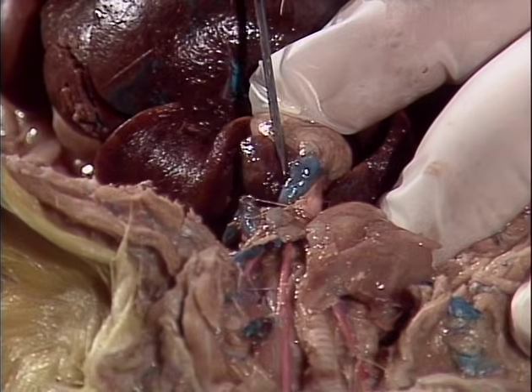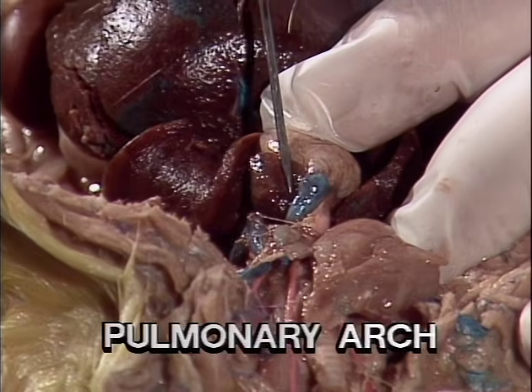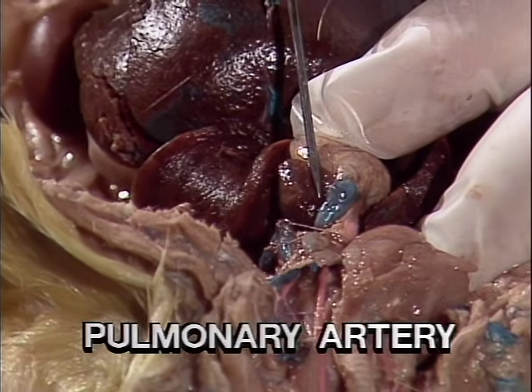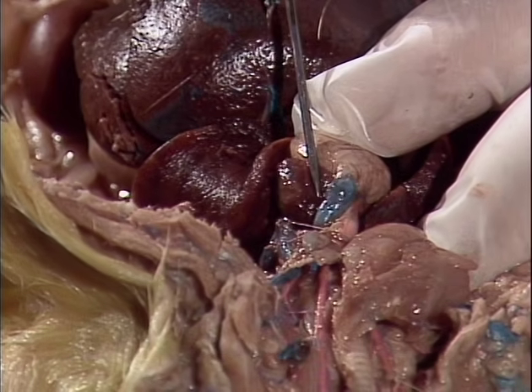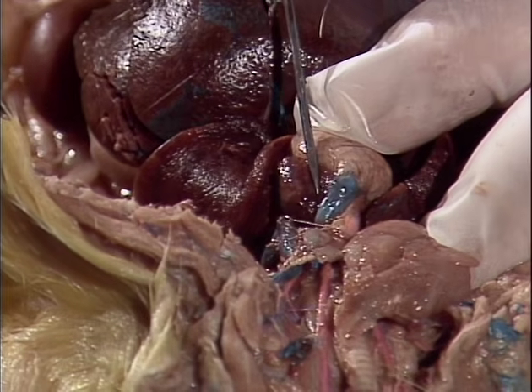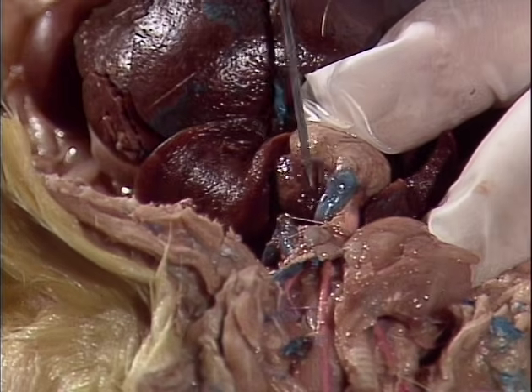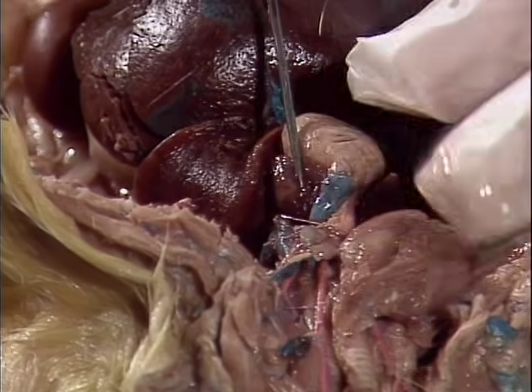The large blue vessel that can be seen arching out of the right ventricle is the pulmonary arch. It divides into a right and left pulmonary artery. These major arteries carry blood from the heart to the lungs. The pulmonary arteries carry deoxygenated blood, and while the blood is in the lungs, it will be oxygenated and returned to the heart through the pulmonary veins.